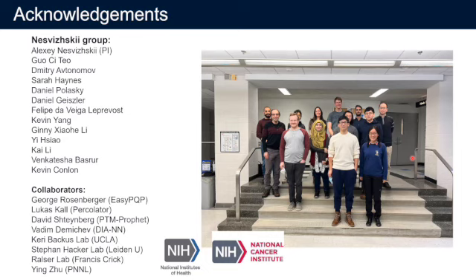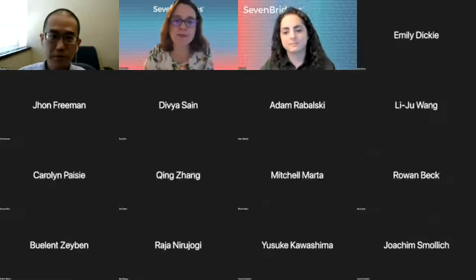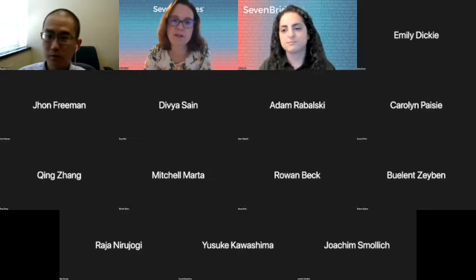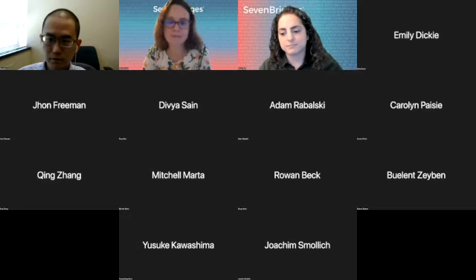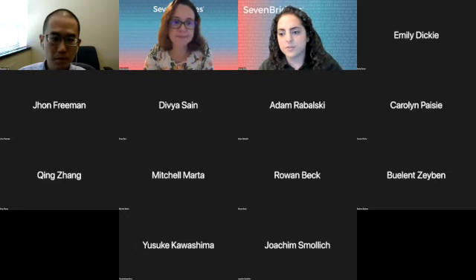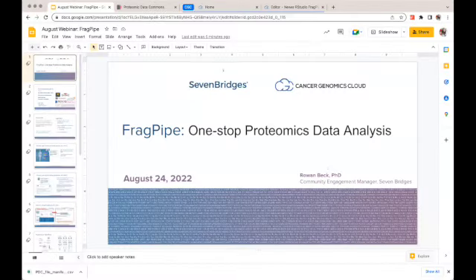Thank you so much. So we're going to switch now. After this wonderful presentation about FragPipe, we're going to have Rowan. If you could stop sharing. Sure. Rowan can share her screen. I think she's going to do a very brief presentation on what FragPipe looks like on the CGC, and then she'll do a quick demo. Hi, everyone. Give me just a sec, and I will share my screen. Okay, let's start the slideshow.